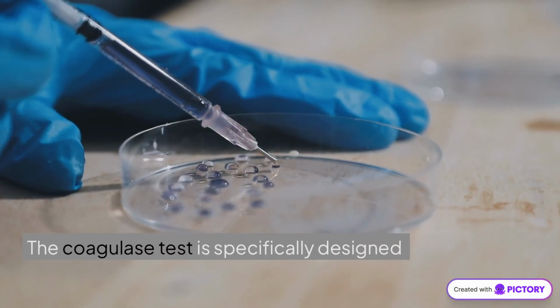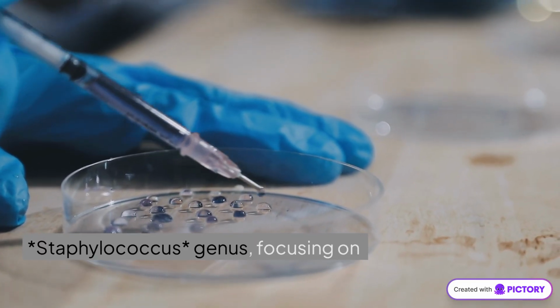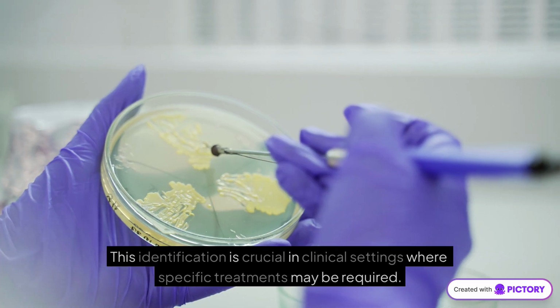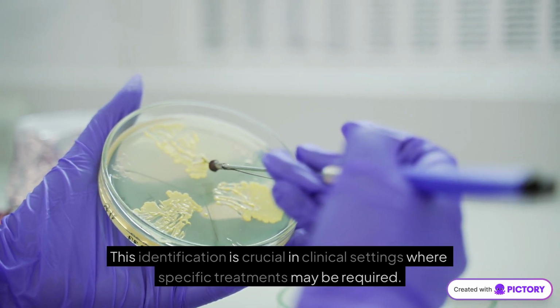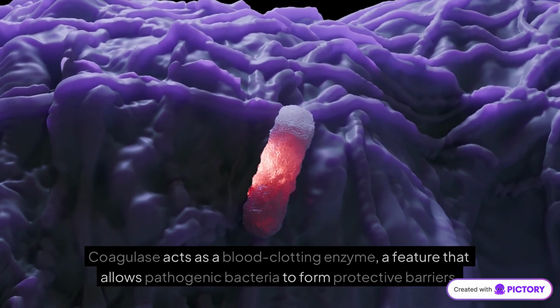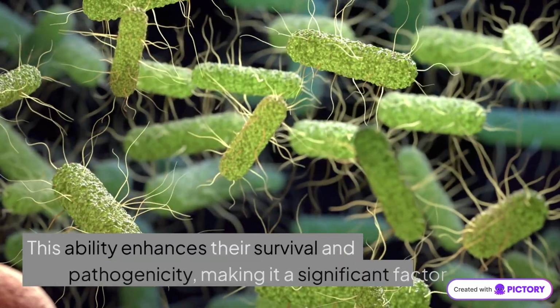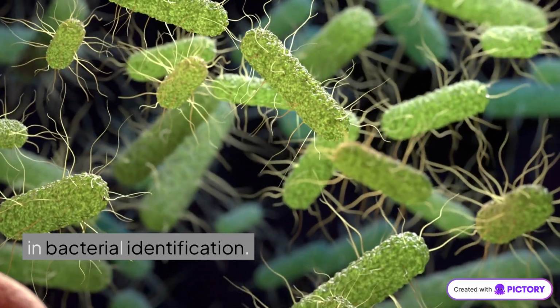The coagulase test is specifically designed to differentiate between species within the Staphylococcus genus, focusing on identifying pathogenic strains like Staphylococcus aureus. This identification is crucial in clinical settings where specific treatments may be required. Coagulase acts as a blood clotting enzyme, a feature that allows pathogenic bacteria to form protective barriers. This ability enhances their survival and pathogenicity, making it a significant factor in bacterial identification.